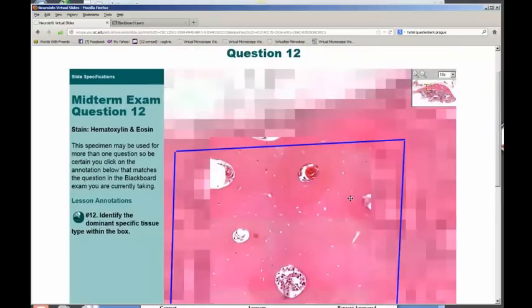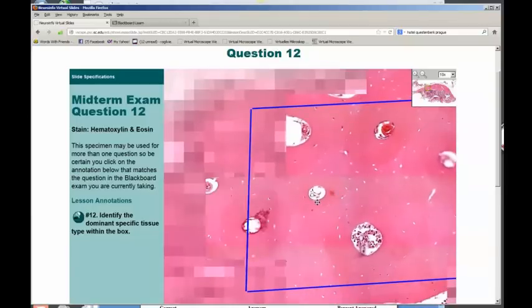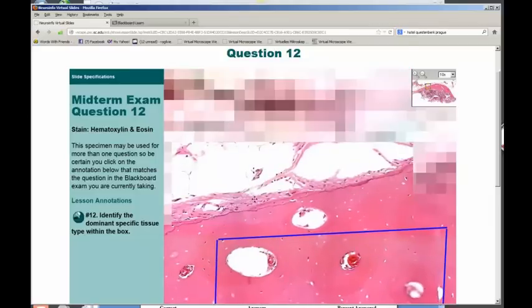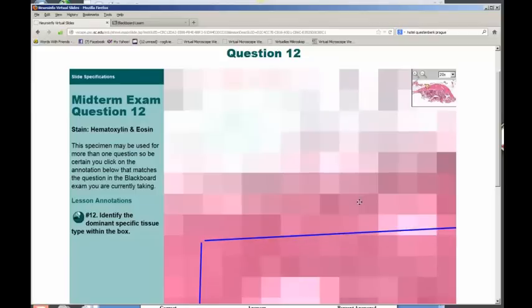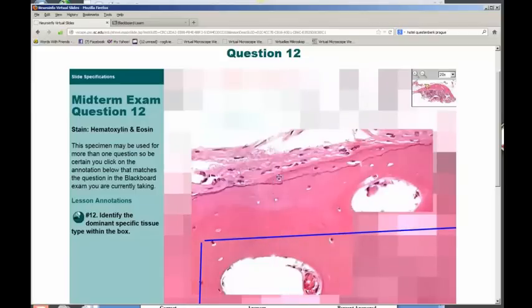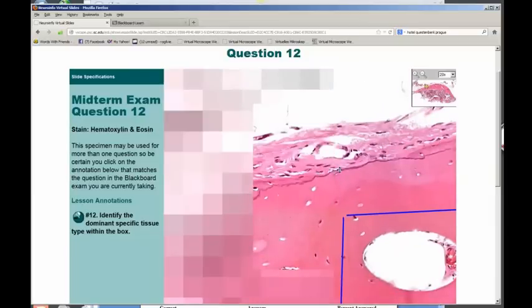When we do, we see that there are structures. In fact, I even think I see a blood vessel here and another blood vessel here in this structure. If you look on the outside, this is the edge, and at the edge I can even see some osteoid and kind of a cement line where there's more bone forming here with osteoblasts along the surface.